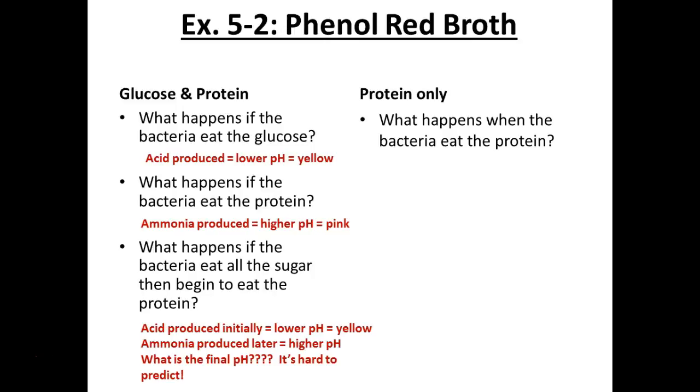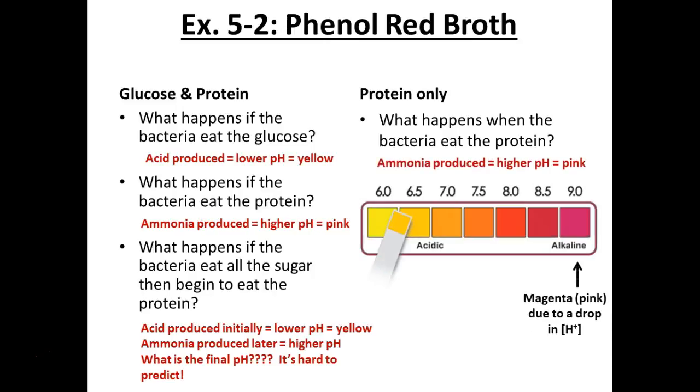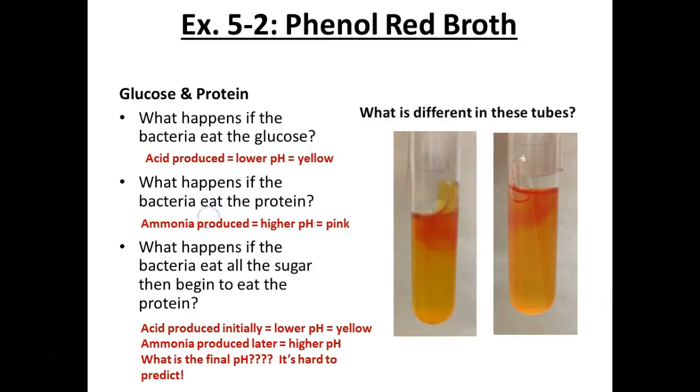Yours is going to turn pink, right? So you know yours eats up all the sugar, and then it'll move on to the protein. Now, if it produced gas, that's a good clue, right? But what if it was an organism that did produce gas? How are you going to know? This is why I refrigerate them, so that I could stop them before they ate it all up.